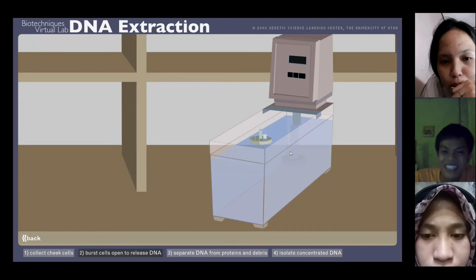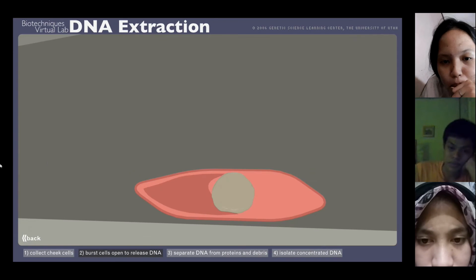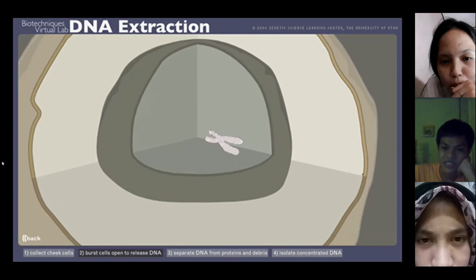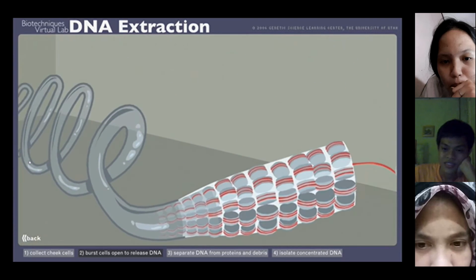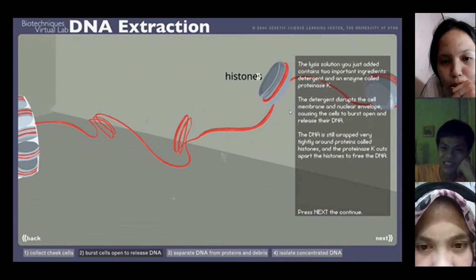Oh, wow! Ito na yung DNA natin with histones.